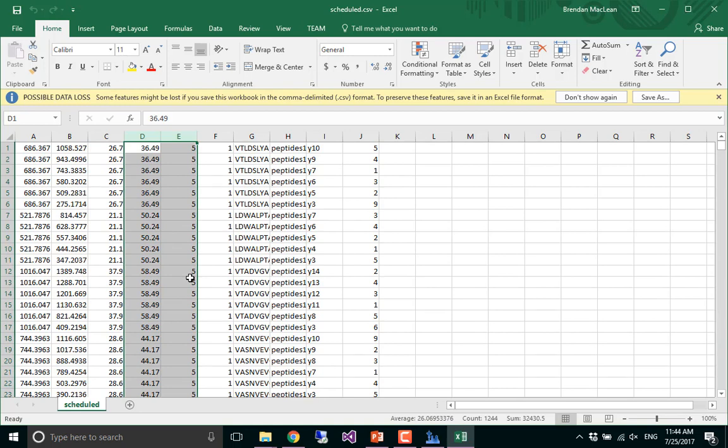There was a checkbox there where we could do start and end times too. But yeah, pretty easy to now set up this method to measure it scheduled. Everybody with me? Okay, so I'm going to close that down.